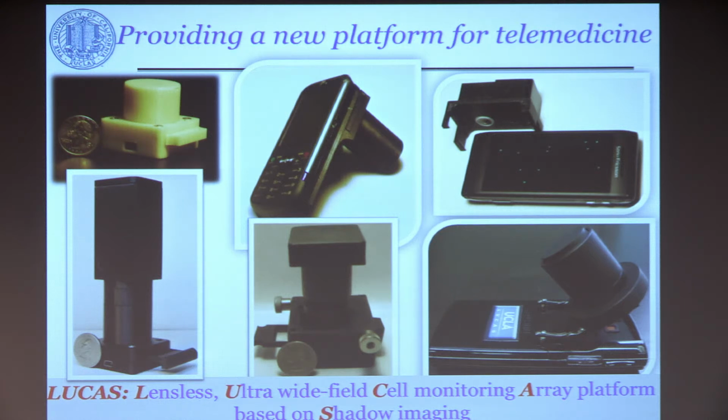This was a brief overview, but now I'd like to give you some more examples of what you can do and how competitive some of these interfaces can get. And I'll start with microscopy because microscopy is universal. It can be used for various different tasks. So some of these interfaces that you see here are not your father's microscopes in terms of their design.